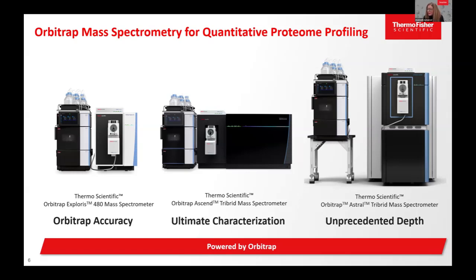As I think Rick mentioned earlier today, even PTM DIA is in uptake. Indeed, I was talking to Evotec, which is a CRO in Germany. They do all their PTM work, phosphorylation, ubiquitination, everything, with DIA now, where they used to have a DDA method before. It means people are using it, and as they're using it, they play with the method and optimize it. And the beauty of being at Thermo is we get to work with the scientists in the lab to optimize different methods and workflows on, I'll call it, our three best instruments for proteomics applications.